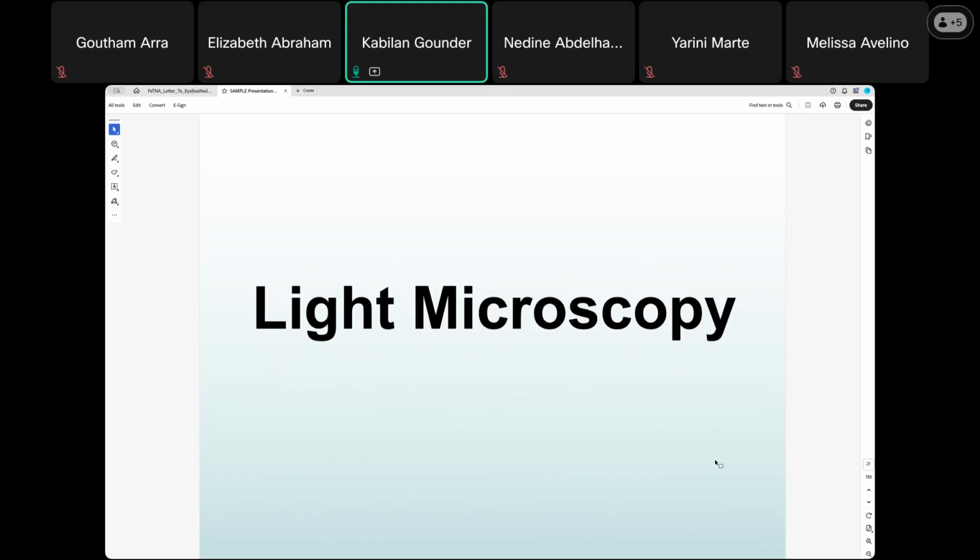So this is the basics of the theory and the milestones, from a magnifying glass, to magnifying lenses and different compound microscopes. Instead of one lens, they use two lenses, which reduces the chromatic effect and increases the resolution, so that they developed different electron microscopes. And these are all very, very important for understanding the history of these microscopes.